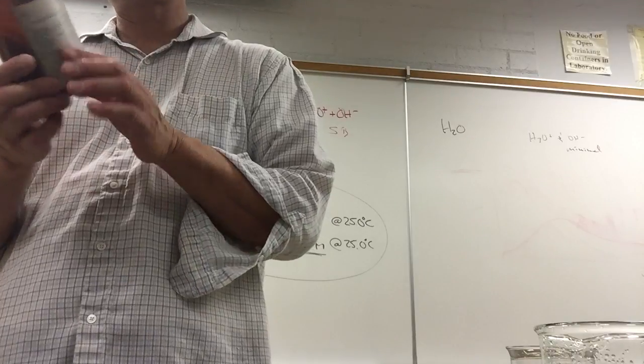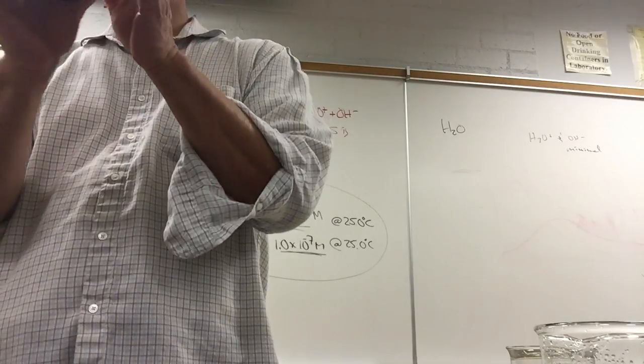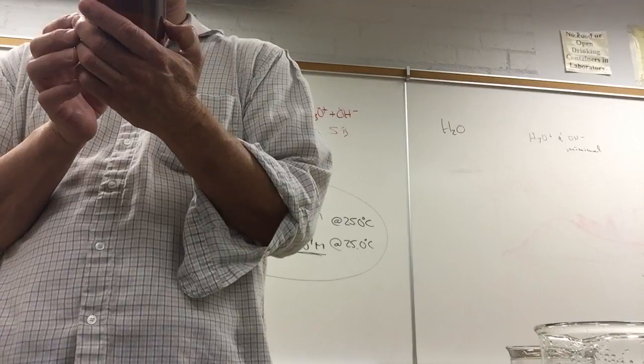This is reagent grade sodium chloride, the sodium chloride you buy from the chemical company.